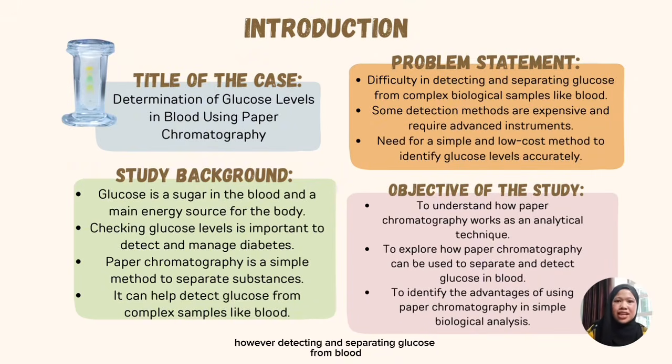However, detecting and separating glucose from blood can be difficult because blood is a complex mixture. Some methods to test glucose require expensive and advanced instruments. Therefore, a simple and low-cost method like paper chromatography can be useful for this purpose.